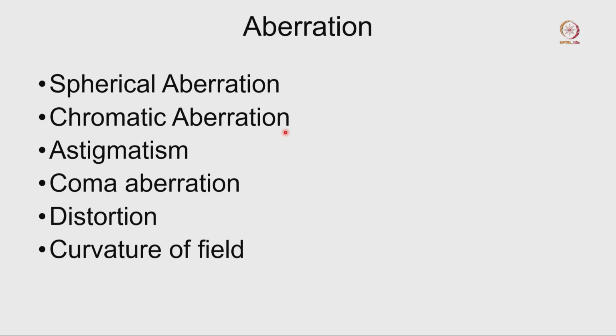There is a wavelength range from 450 nanometer to 750 nanometer, and due to differences in the materials of the lens system, the light rays will be separated into blue, green and red. We can see all these blue, green, red lines when we try to image. So sometimes when you collect the image, you can see some reddish or greenish appearance. So this is the aberration. Now I asked one more question: this kind of aberration is available in a light microscope or any kind of camera we are using, and there is a proper procedure to correct those things.